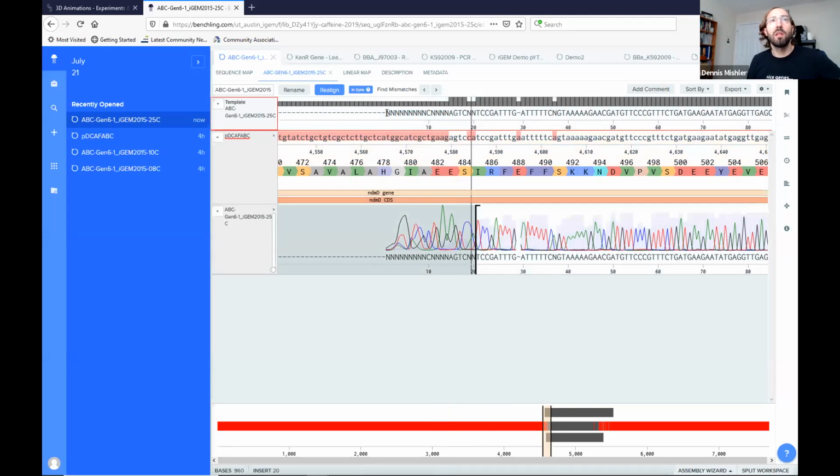So let's go ahead and look at the sequencing result. First, red means it doesn't match, okay? So red, it's not matching because these are Ns, so there's not enough information there. We then start to look here, and you can see once we get to here, we start to see very few reds. So the reference file is matched by the sequencing result. And everywhere we see that there's not red, it's a good match. That's perfect, great.